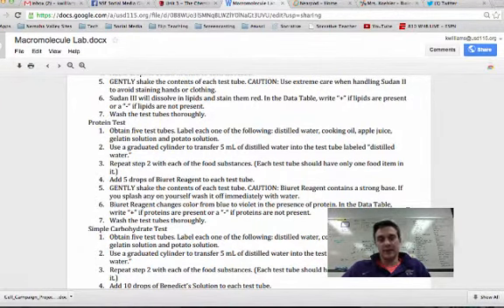Then move on to the protein test. For the protein test, 5 test tubes again. You put 5 milliliters of each solution into its own test tube and make sure that it's written on that test tube what it is. That's why I have the glass marking pencils. Now you're going to take 5 drops of biuret reagent, and be careful with this stuff because it is a very strong base. Okay, so it can be a big time skin or body irritant. So be careful with that.